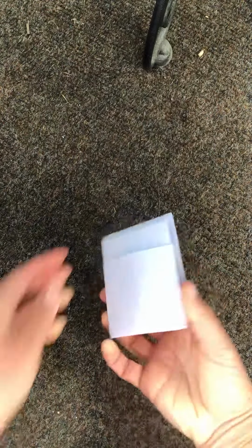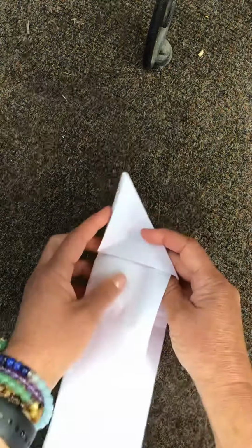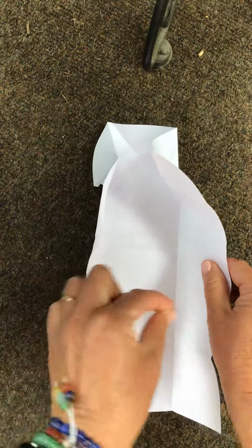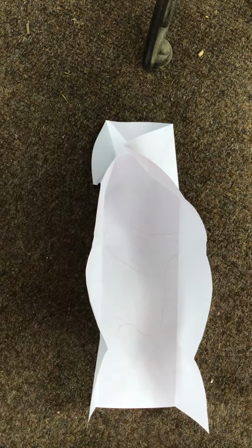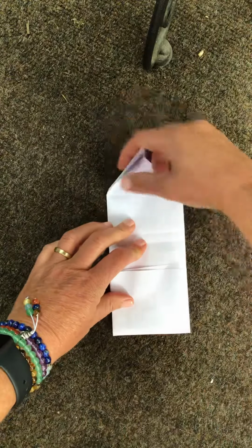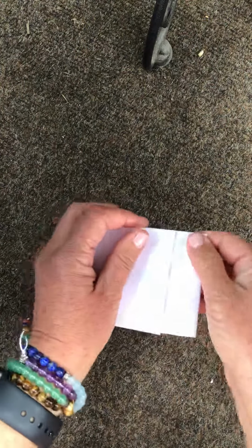I saw a hair flying around when I was making this druggist fold. I should have probably packaged it inside. So what you're going to do once you make the druggist fold, you unfold it here. You're going to put whatever evidence you found, here's that hair, whatever evidence you found, for instance, a hair, you're going to package it in there. Now we're going to refold it, stuff it in. Now that hair can't escape. We're going to take it back to the crime lab.